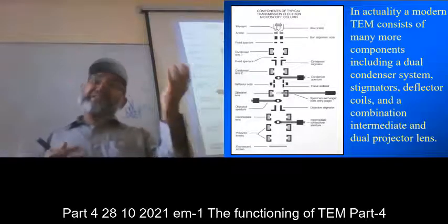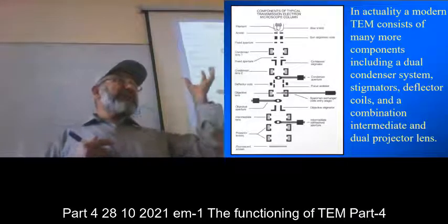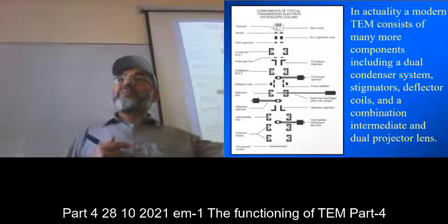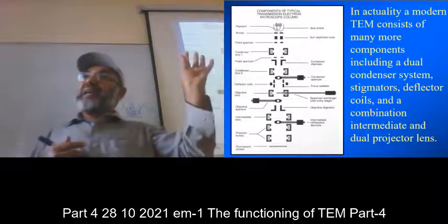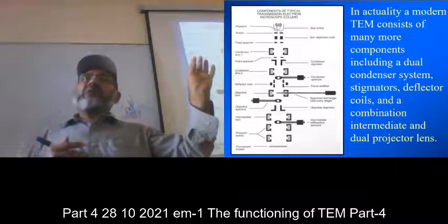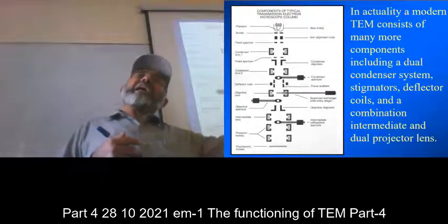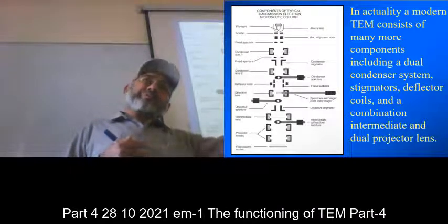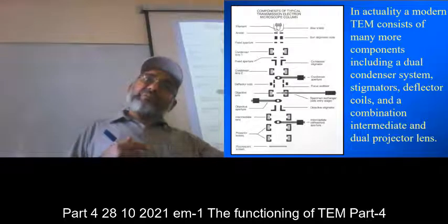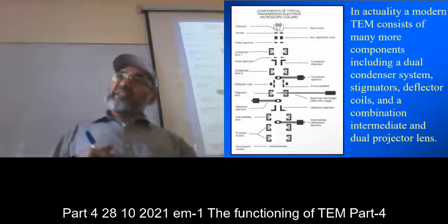Stigmatism is basically blurring, right? So when the image is blurred and that blurring mixes a 1 nanometer area, then you can't see any crystal which is below 1 nanometer, because every edge and every piece is blurred by that amount.